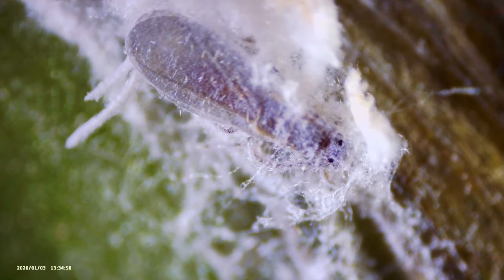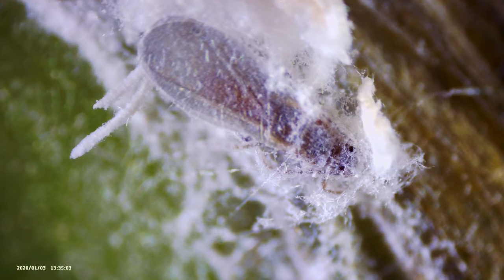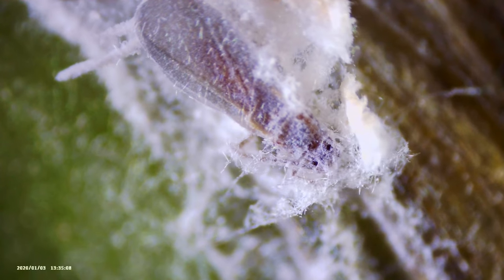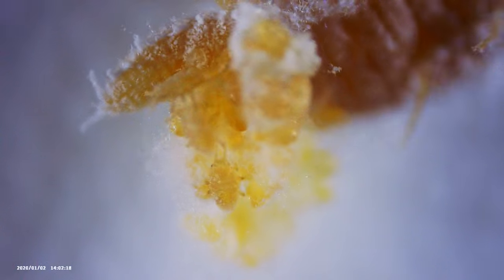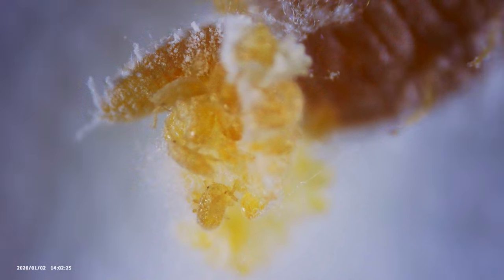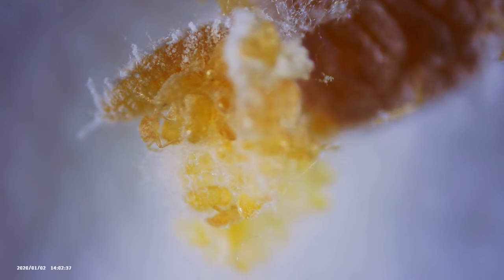I also noticed that mealybugs get wings — I should have assumed that's how they spread so quickly. I can see one that's almost waking up out of its nest with wings on it, and that terrifies me because it means these things can fly and spread fast. These are always a pain to get rid of on succulents and anything with tight cracks. Mealybugs are one of the more interesting pests though, because of their weird body shape, the little fur they create, and the little nests — really interesting, but I hate them because they cause damage and are so good at hiding.